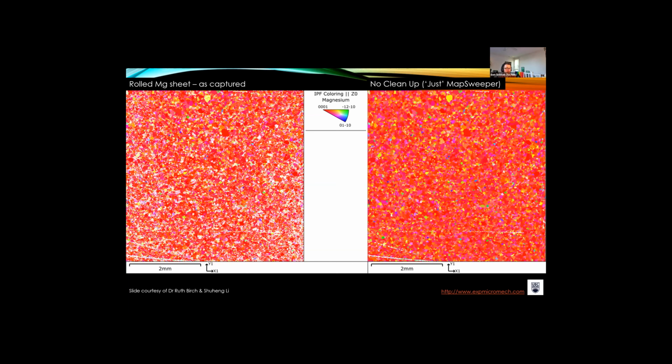The last and final method, which is used often by the geological community, is to insert an imaging gas into the chamber. So to use a variable pressure and introduce perhaps a very small amount of water vapor or other gases that can effectively dissipate the charge through the formation of the charge cloud. So you'll get a slight reduction in the diffraction patterns because they're going through the imaging gas itself, but the gas itself will deal quite nicely with the charge cloud in there. And some microscopes are equipped with charge cancelling guns, so you can flood a certain area to have those. They're often not well set up geometrically for EBSD stuff. So a few different suggestions on that.